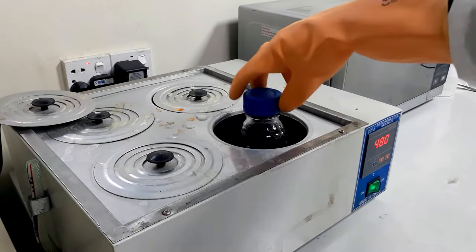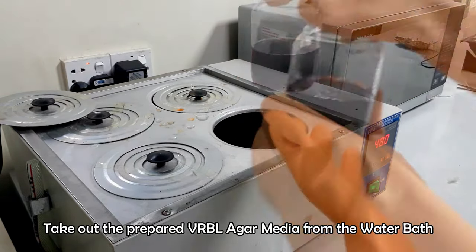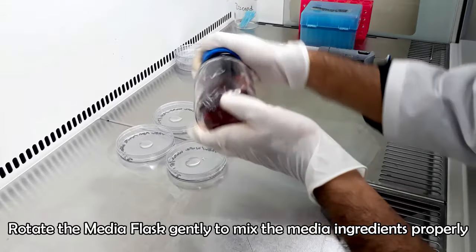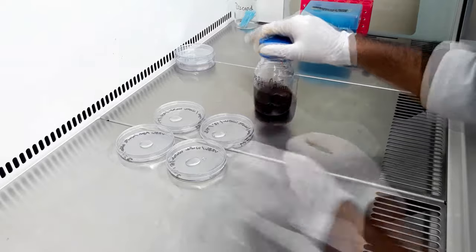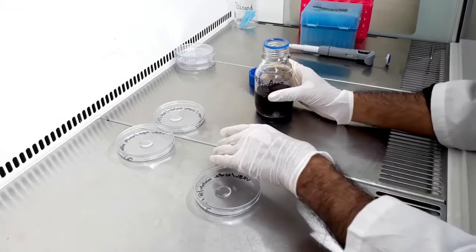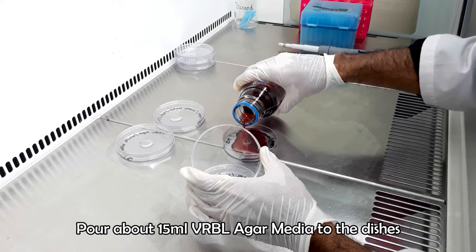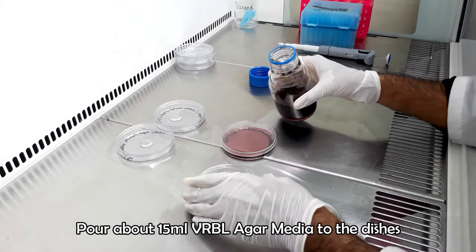Let's bring the prepared VRBL agar media from the water bath, which was maintained at 48 degrees Celsius. Rotate the media flask gently to mix the media ingredients properly. Now, pour about 15 ml of VRBL agar media in both of the petri dishes containing diluted sample. Media temperature should not be higher than 48 degrees Celsius.